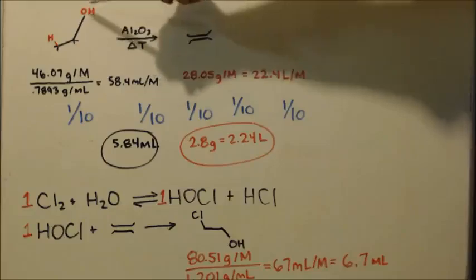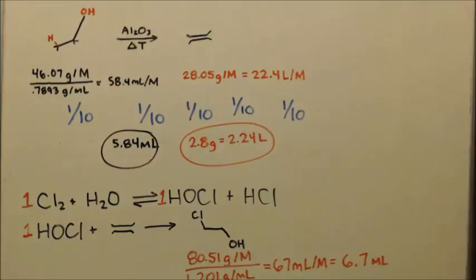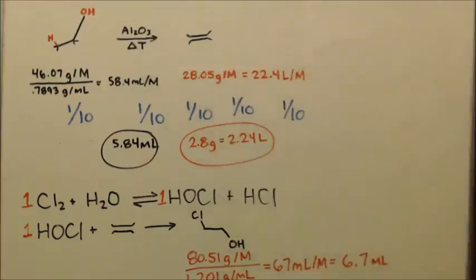And I want you to notice, look at this OH. Look how far away it is from the other bonds. This is a long bond. It's like dangling out there. But anyways, we're going to delta T. We're going to add some heat.